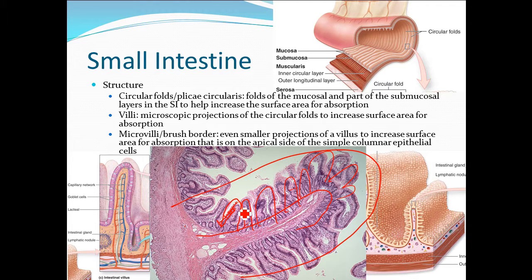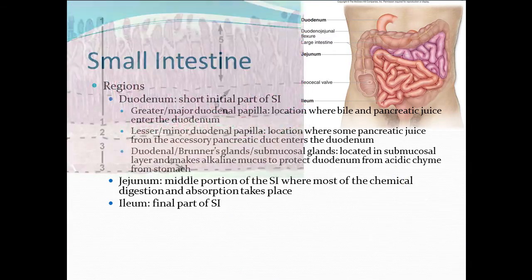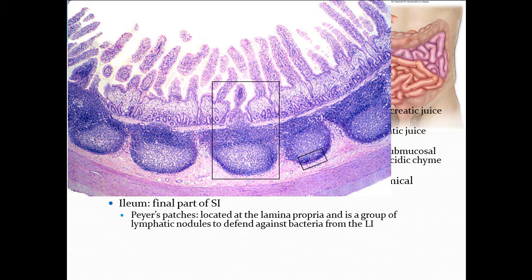So the empty holes there, the white circle, yeah, and also the pink circle, are those empty or the blood vessel? Yeah, correct, and that might have some blood vessels going through it. Exactly. All right, but looking back over here, what are these things that dip downwards here? Yeah, intestinal glands.